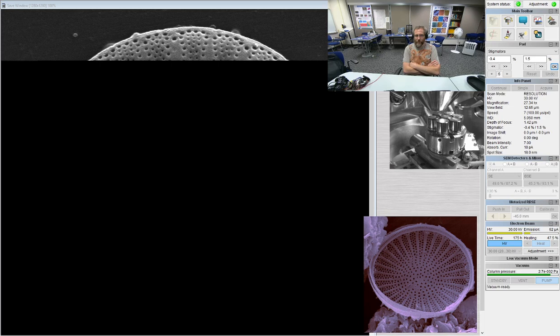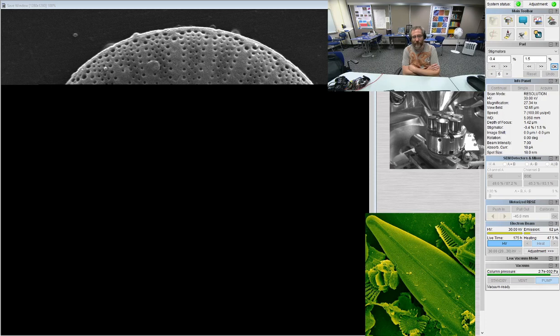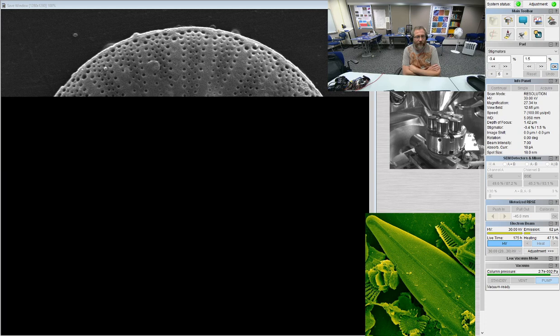Chad does the same thing with his phytoliths, and he uses some chromium something or other. I don't remember what he uses instead of SPT, but he was telling me he likes it a little bit better for the phytoliths for some reason.